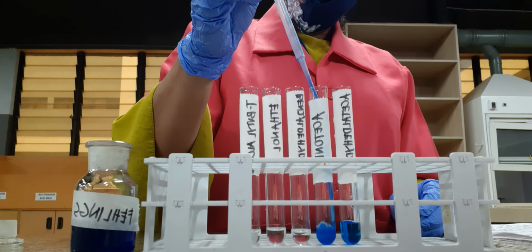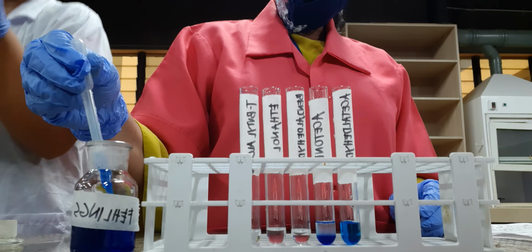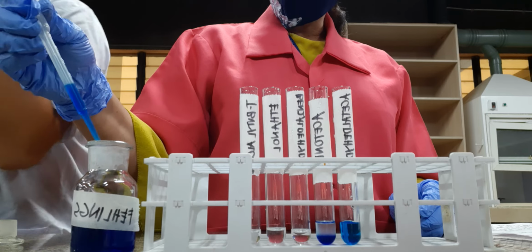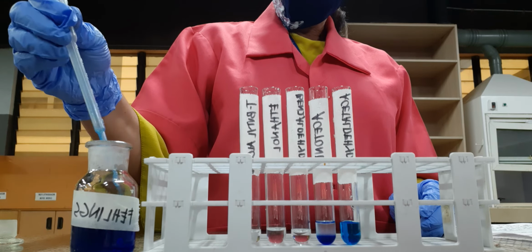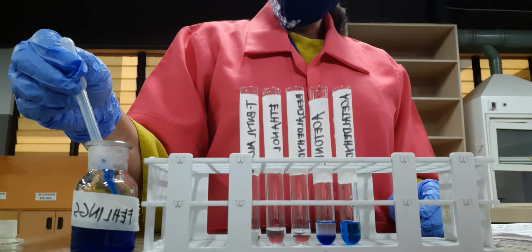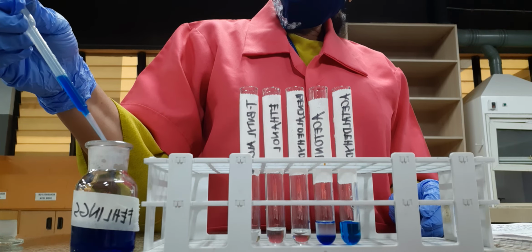And then we have acetone. I-warm, kung warm na siya. Ilan kayo?